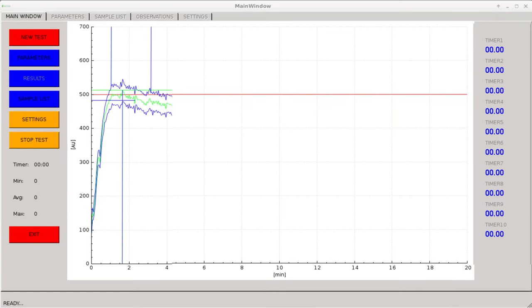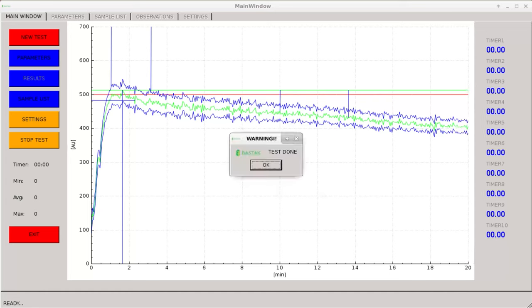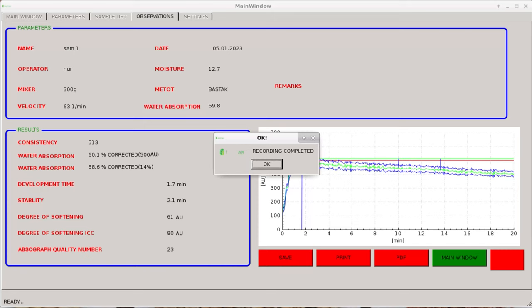The test time is 20 minutes in total and the device must reach the standard slope value of 500 AU. When the test is completed, the test completed warning appears. By selecting the results indicator, the analysis result is displayed on the touch screen. The analysis result can be saved in the device memory as PDF, transferred to the computer, and printed out.